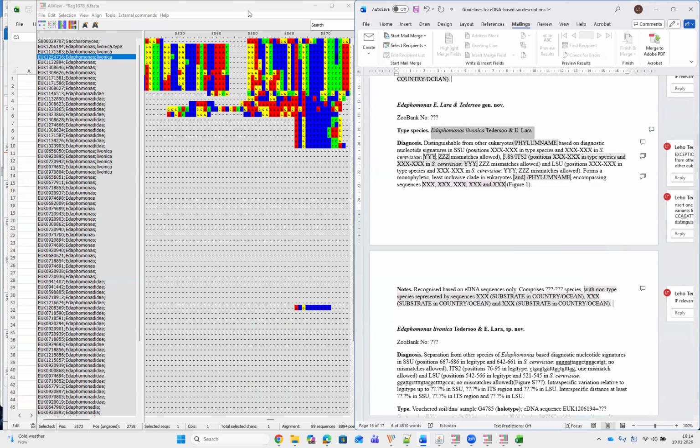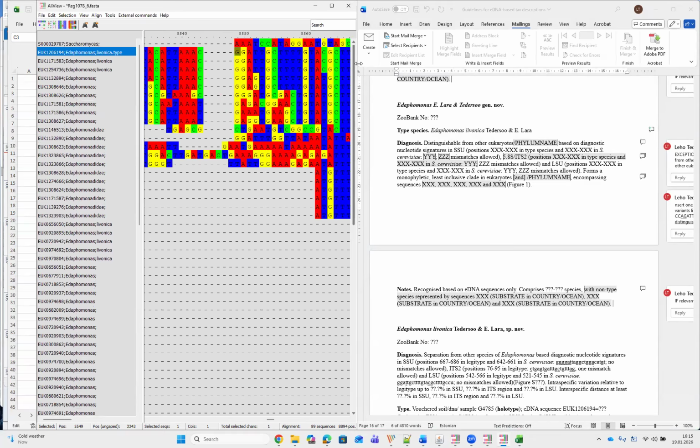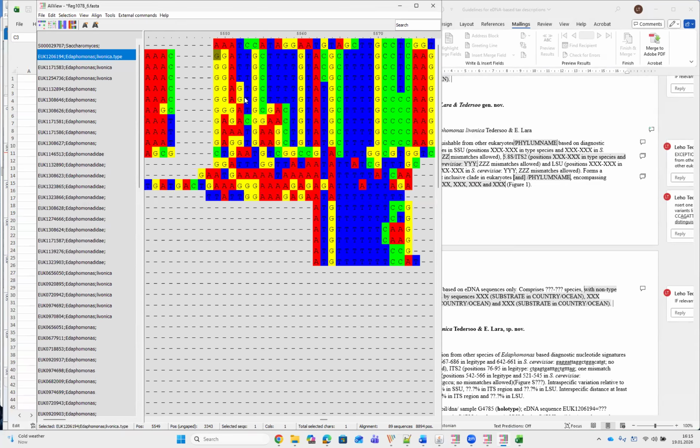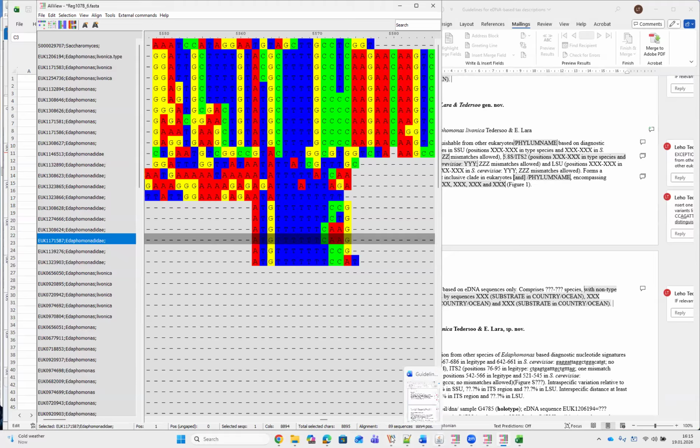But there is one thing we forgot, and this is taking the screenshot for the species and the LSU barcode. So it's better to do it immediately, because if we sort those sequences in a different way, then it will be more difficult to get back to the position, and we would waste our time. Yes, so it ends here. Let's do it.